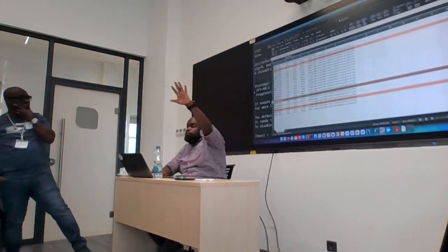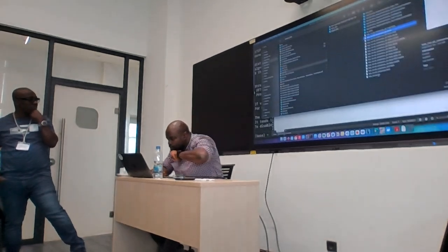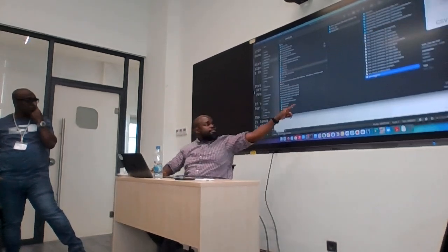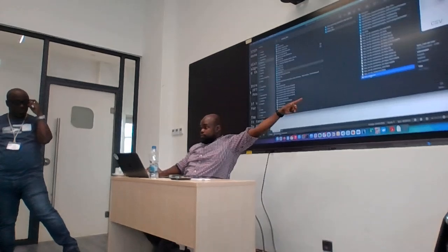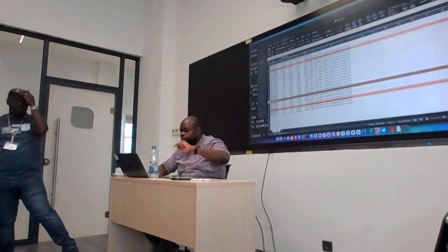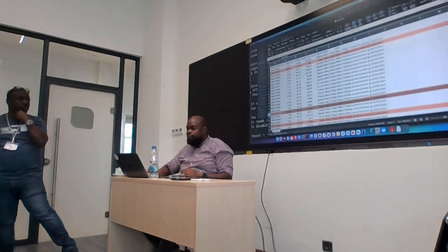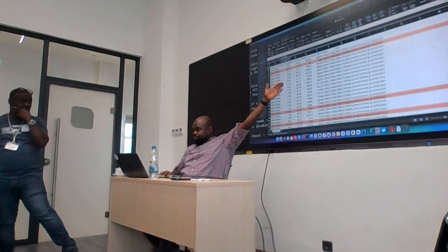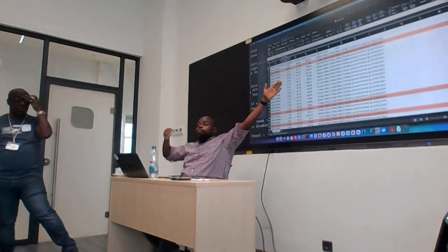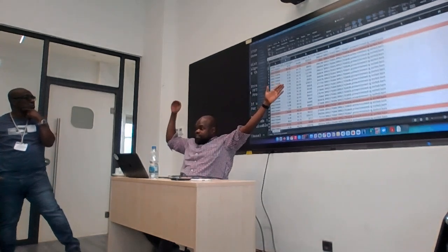in your Epi2Me run, there was a file called qc.csv, right? Did you see that file? And that file gives you information on each of these sequences. For example, here we have the %N. You remember we were talking about the quality of your assembly and where we were looking at the %N.